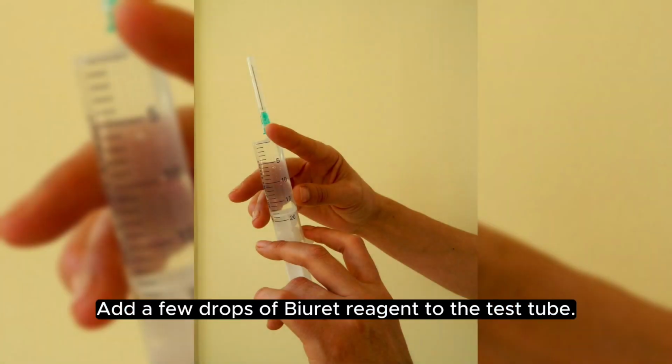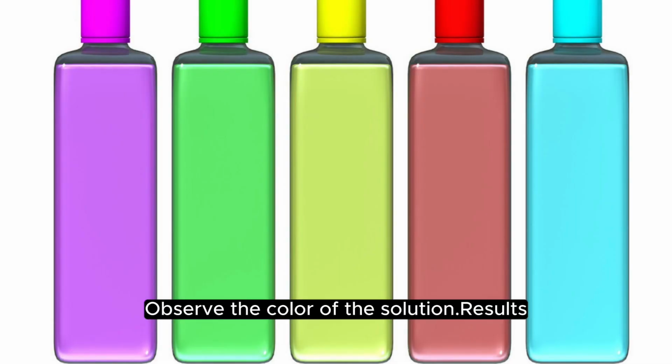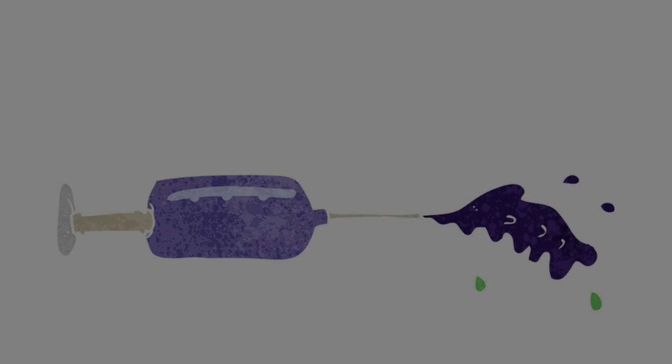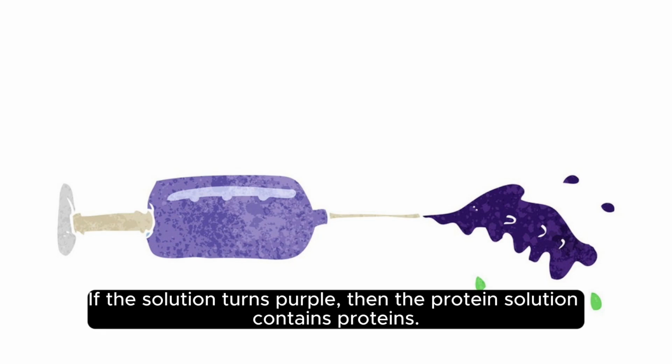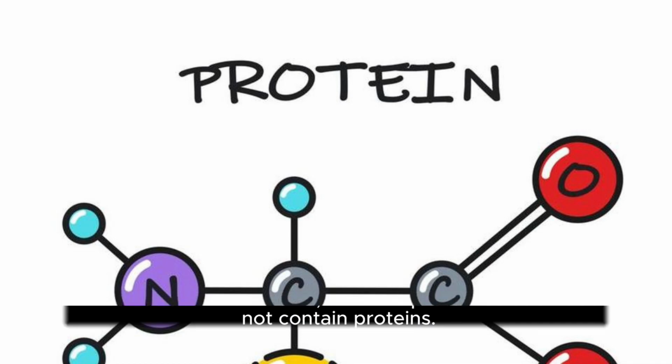Add a few drops of biuret reagent to the test tube. Observe the color of the solution. Results: if the solution turns purple, then the protein solution contains proteins. If the solution remains blue, then the protein solution does not contain proteins.